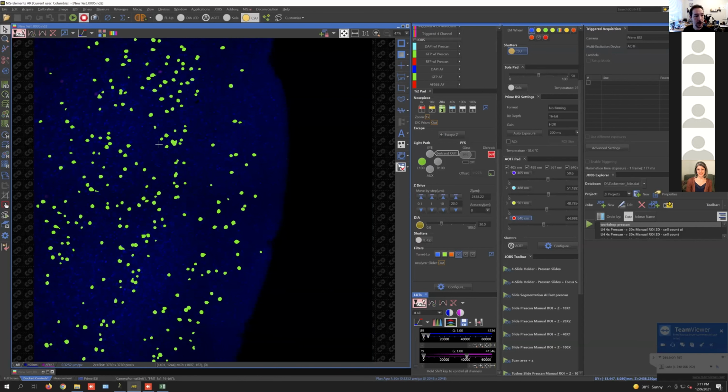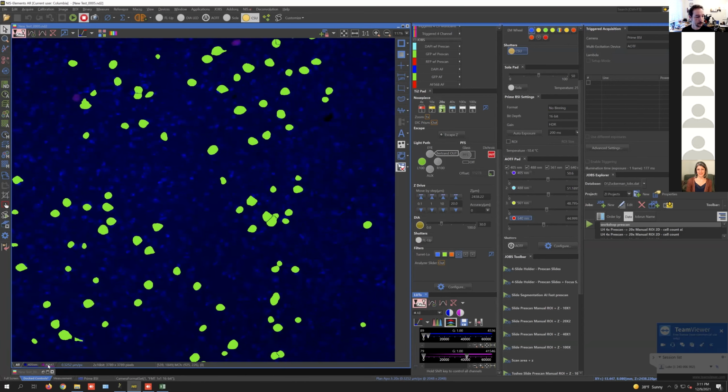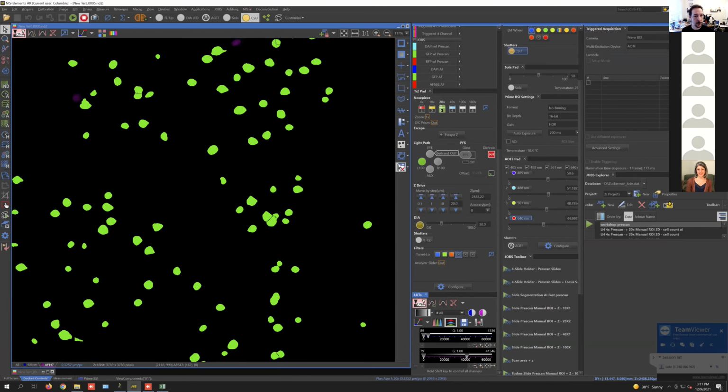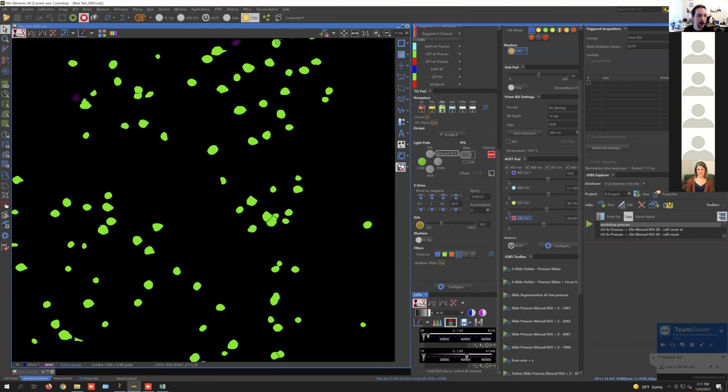And here is an image that shows us how well the segmentation worked. I would always encourage you to get these images before you trust a pipeline. You can see that actually there are some cells that we missed during this, like there's some cells here. And you can toggle these on and off just over here. So it's done a pretty good job, but there's definitely some areas there that I might want to improve upon. That way, having these images as feedback, I can start to work on the pipeline a little bit more. But you can see it's done a pretty good job.